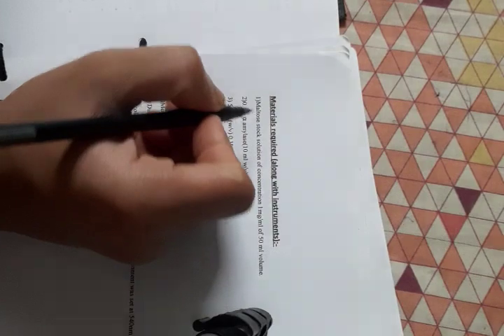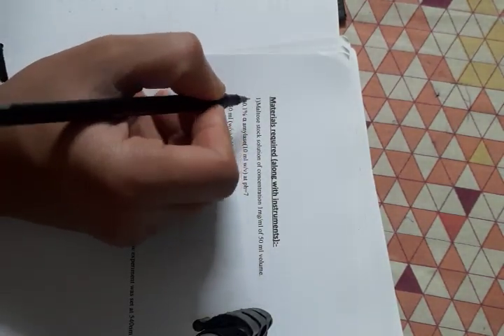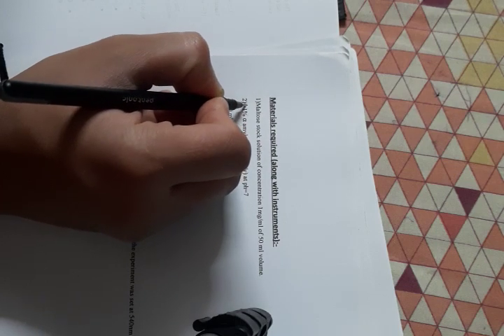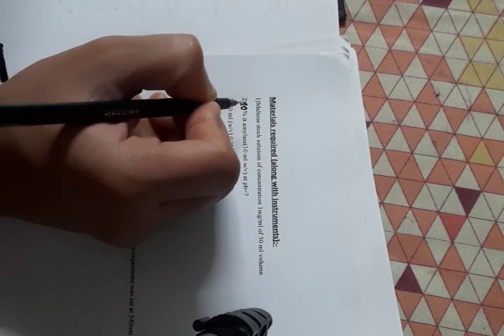Initially it was written 1000, since the dilution was 10 down to 1000, which is why it was written 0.1. But it should be 10, because here I have taken a 10-fold dilution. And that is it then.